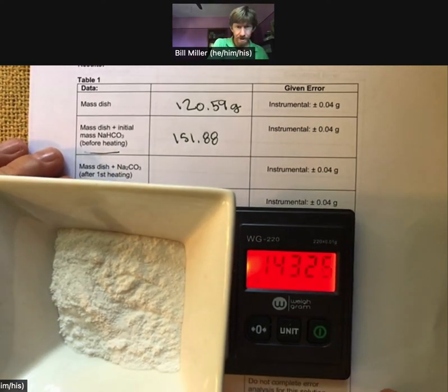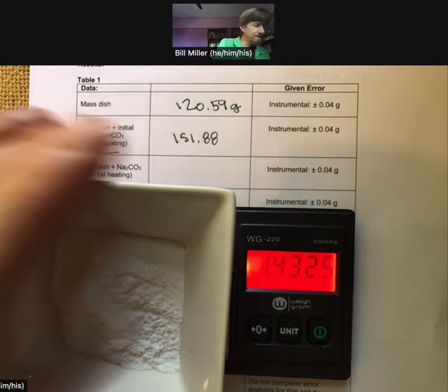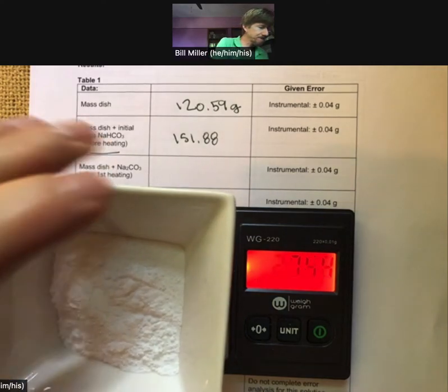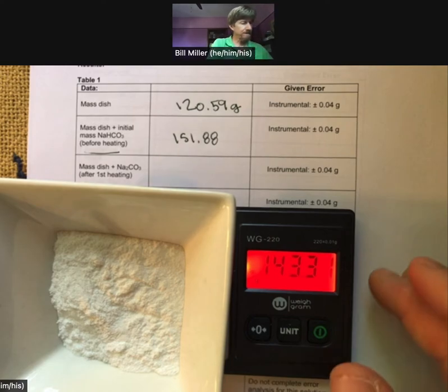143 point... It's still changing. Is it stable? It's a little jumpy. You know what? It's still warm. That's part of the reason it could be jumping around. Let's try it again. Maybe not. Seems to be stabilized now. 143.31.